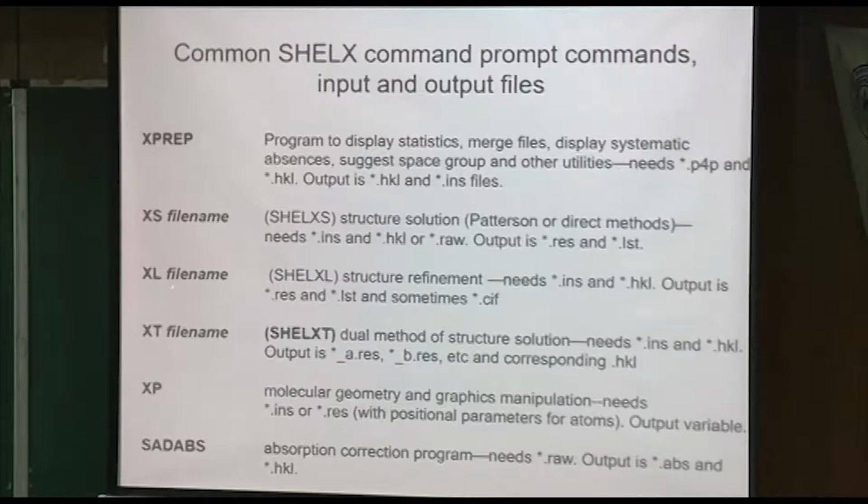So XL, followed by the file name. XL is the refinement program. And you run that many, many, many times in the course of solving a structure, of course. I should also say that that also has a new version, 2017. If you're using the old version of SHELX-L or XL, don't.